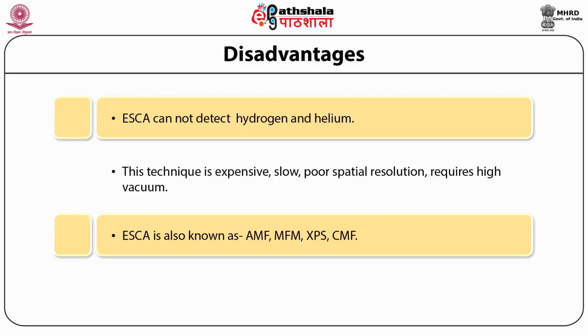And if by chance there's a leakage in the vacuum, you will never be able to get the right result. So one needs to maintain it very well in order to continuously use this. Therefore, one cannot say that it has all the advantages. It has many disadvantages also, and this requires a very high degree of maintenance if one has to continuously use this technique.